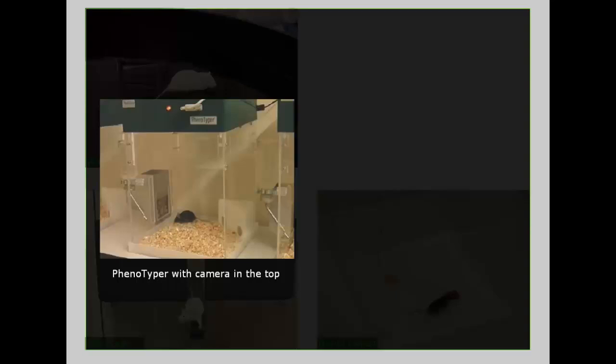The PhenoTyper together with EthoVision can be used for long-term experiments in the animal's home environment. Various stimuli can be used to measure parameters like learning and anxiety just as in traditional tests but in a less stressed environment.